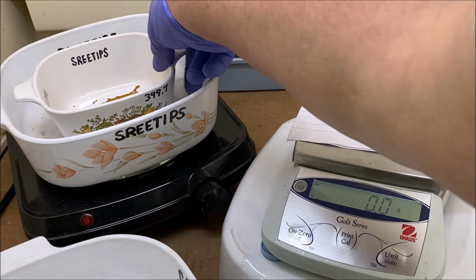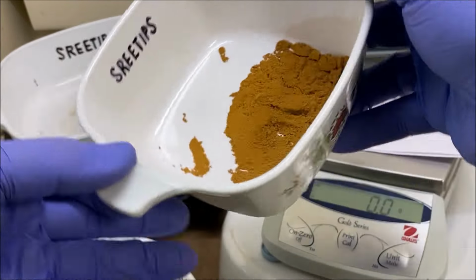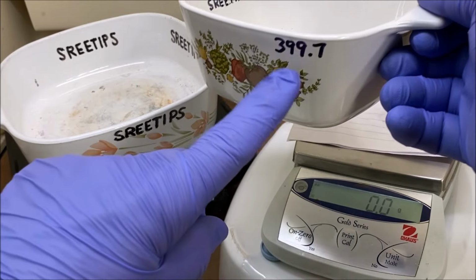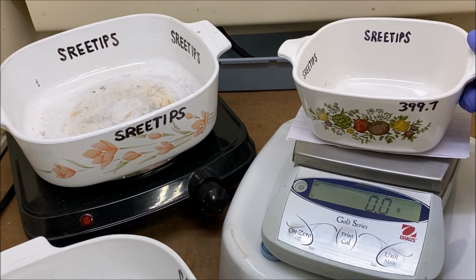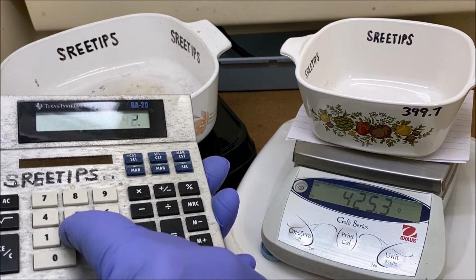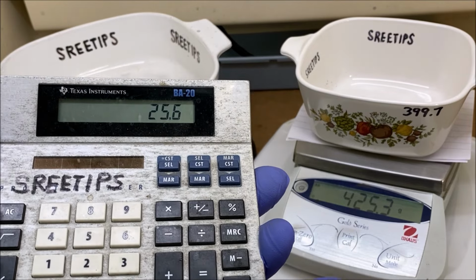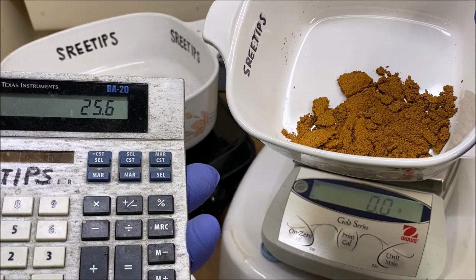Here's our pure gold powder that we've dried out, allowed it to cool off. It looks spectacular. Nice and clean gold in there. And I've written the weight of the container on the side here. Let's put it up here and see what we got. We've got 425.3 minus 399.7. So we've got 25.6 grams of pure gold in here.